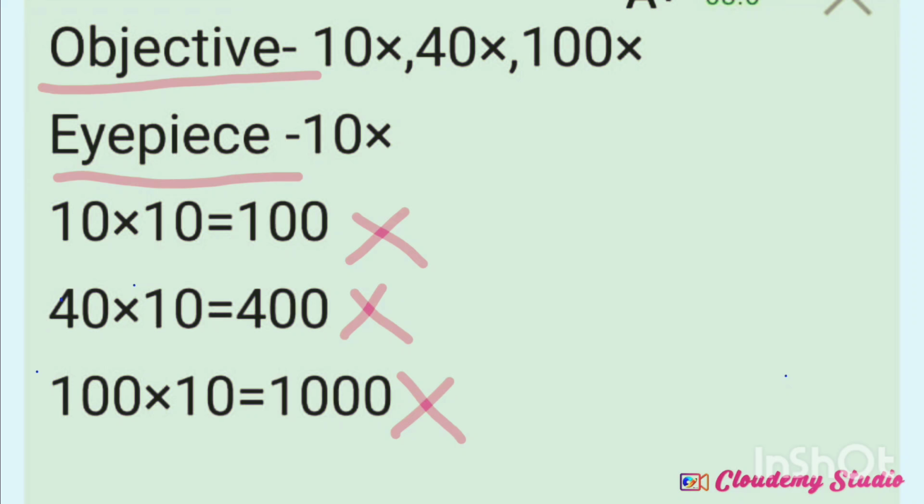अभी यहाँ पे 100x का मीनिंग क्या है कि जब हम माइक्रोस्कोप में इमेज देखते हैं तो उस टाइम हमको इमेज जो है 100 टाइम्स मोर लार्ज दिखती है. दैट मीन्स मोर मैग्नीफाइड इमेज इज ऑब्जर्व अंडर द माइक्रोस्कोप. 1000x का मीनिंग क्या है कि इमेज इज ऑब्जर्व 1000 टाइम्स मोर लार्जर और magnified image under the microscope. So due to this magnifying power of the microscope, the invisible objects become visible and we can observe the magnified or larger image of the object.